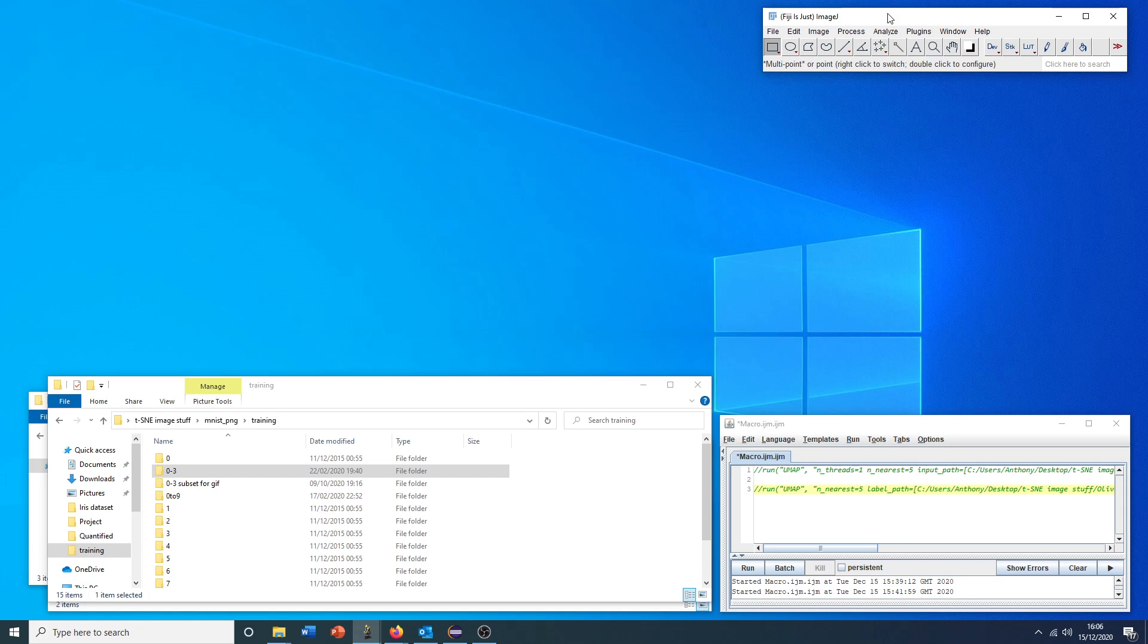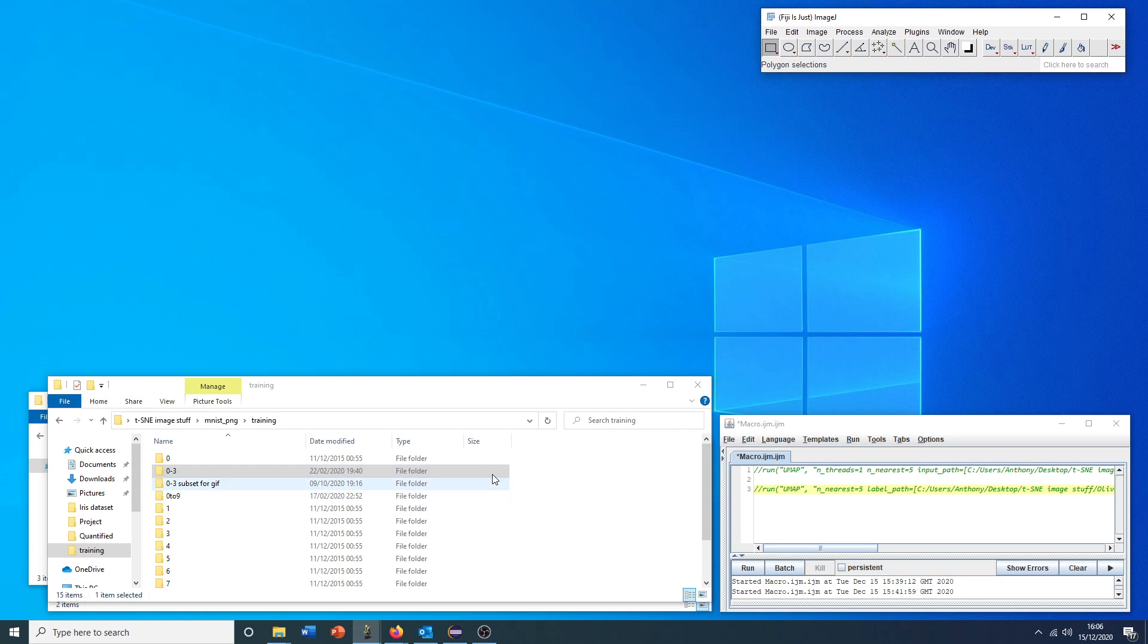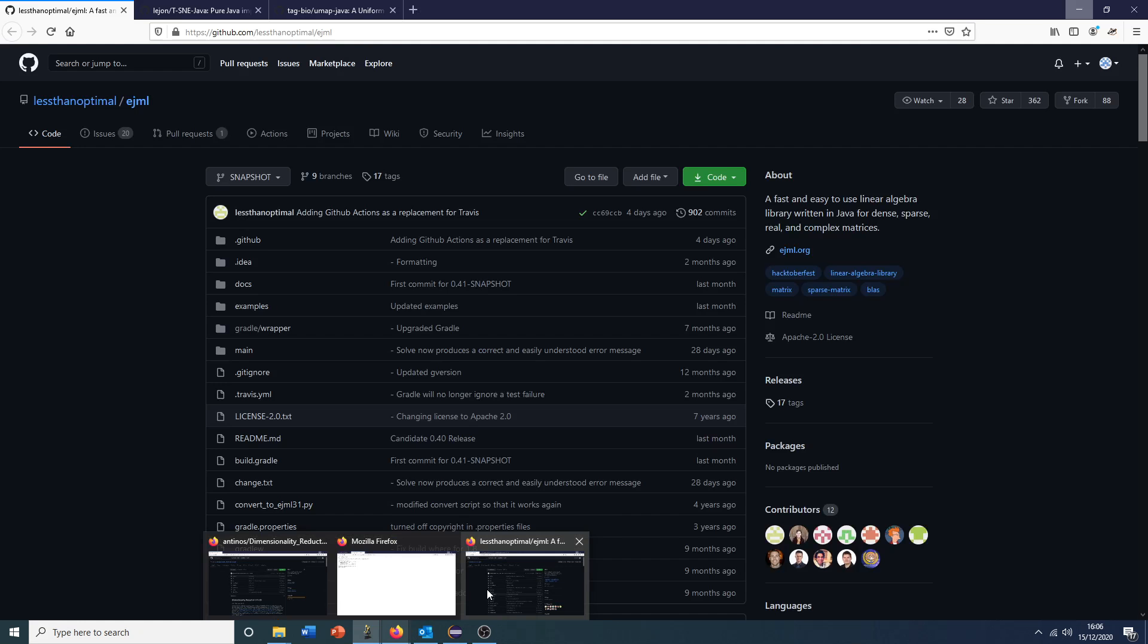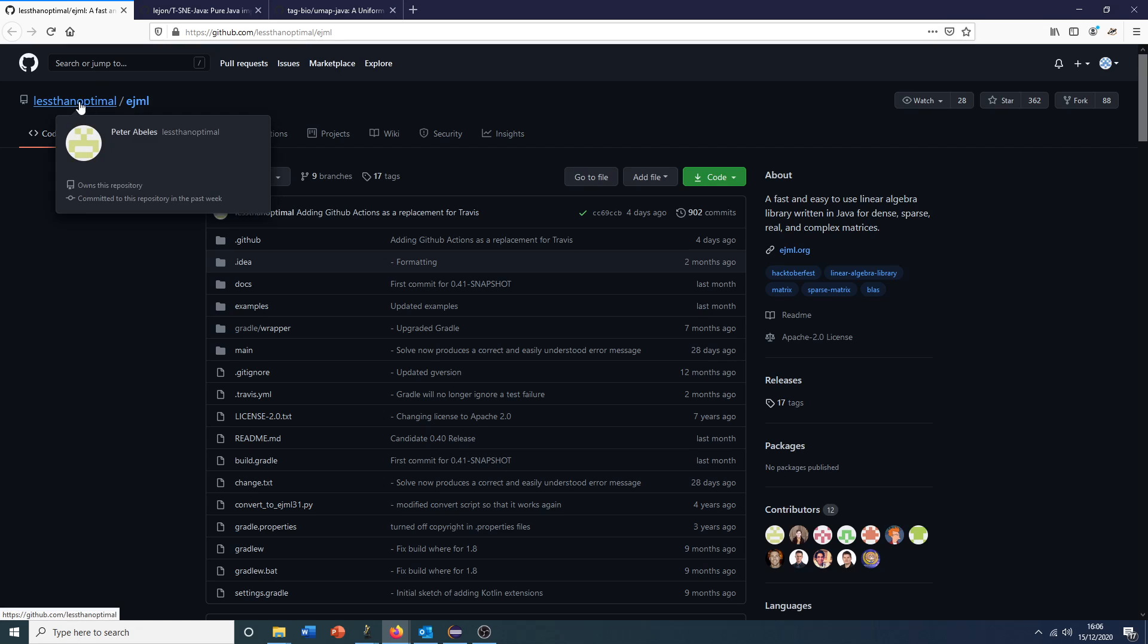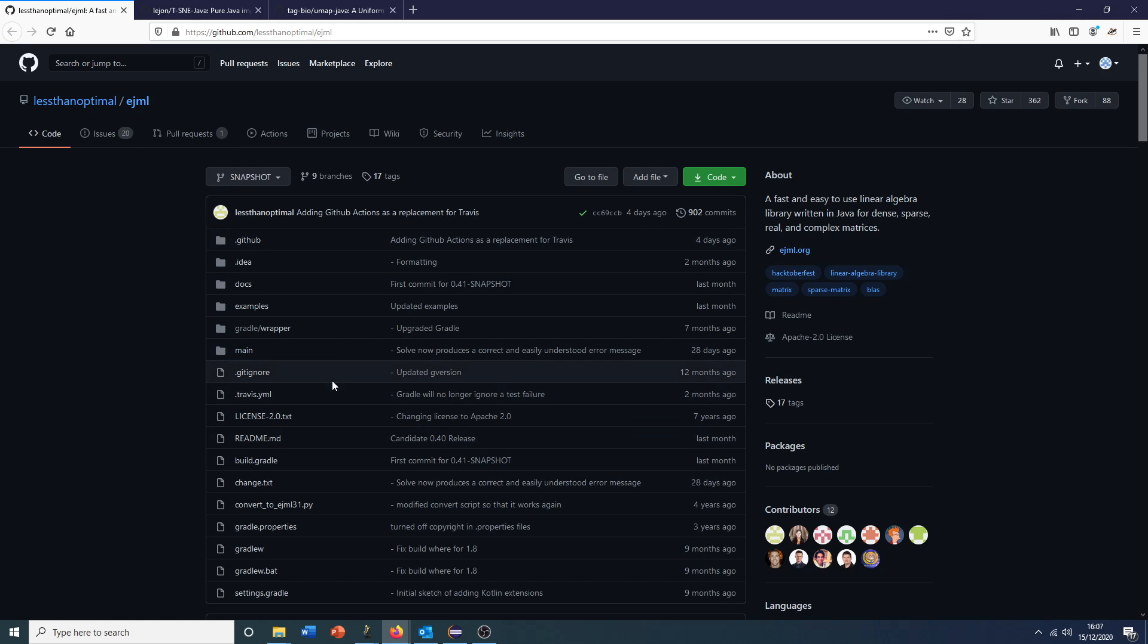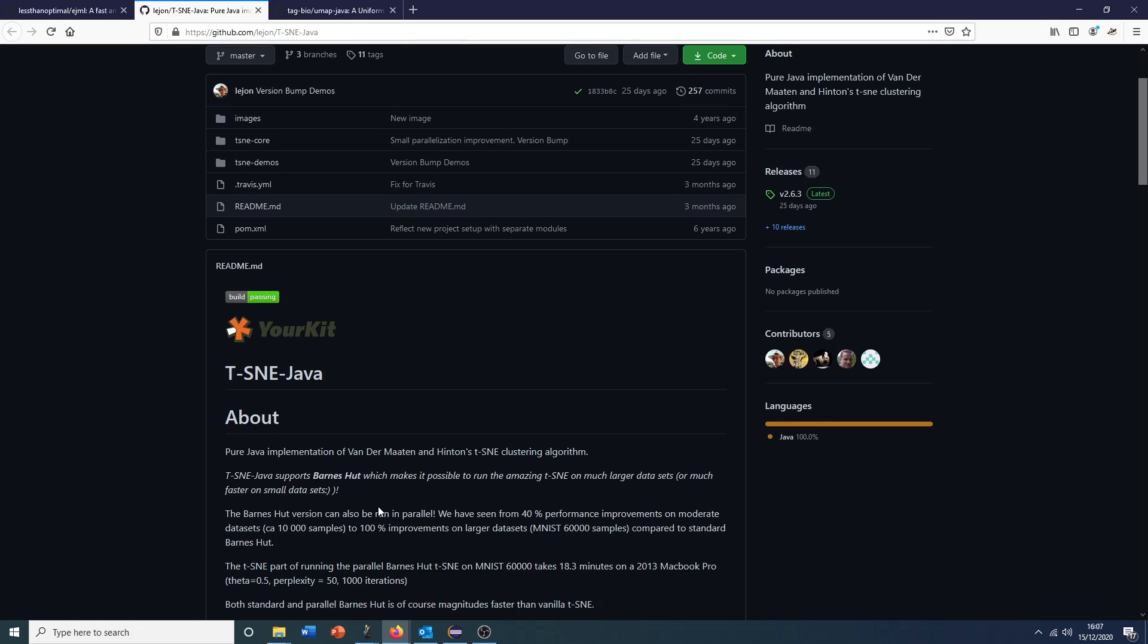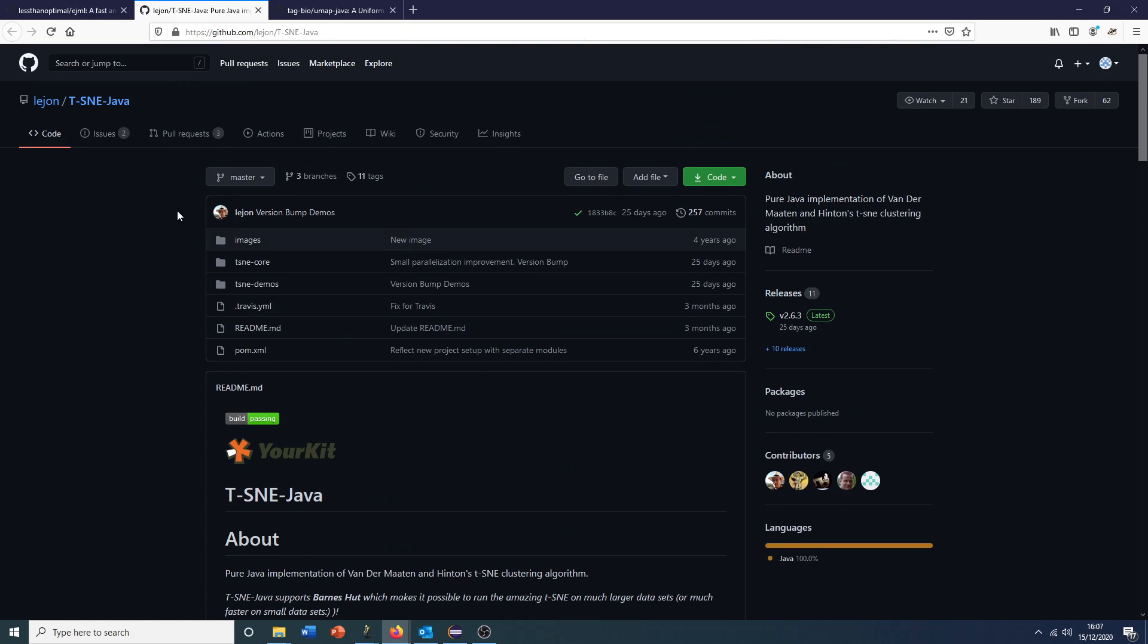I should mention that this plugin uses several open source Java libraries to achieve this. I can just briefly introduce you to those now just to give credit to the original authors. We have Peter Abel's efficient Java matrix library implementation of PCA for Java.